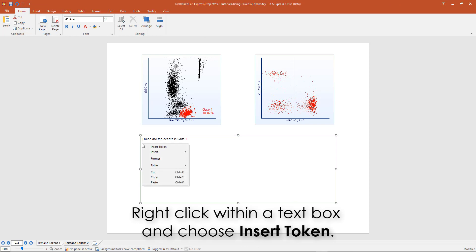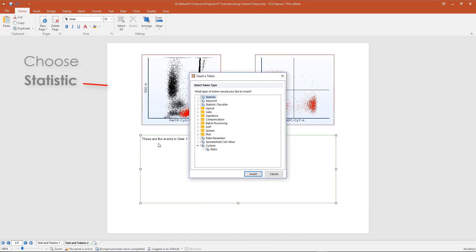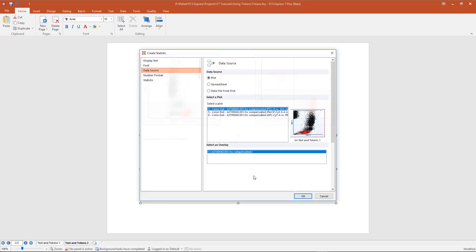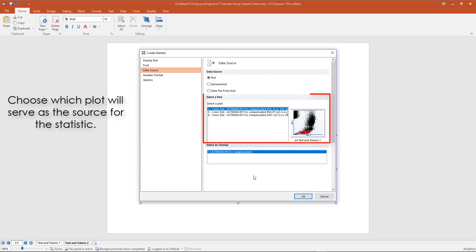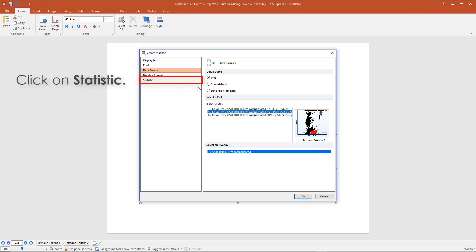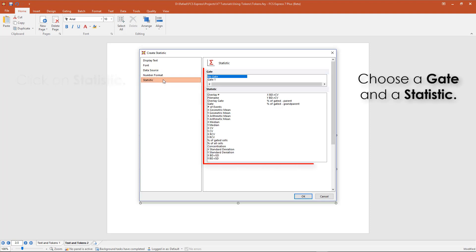Right-click within a text box and select Insert Token. Choose Statistic, then click on Insert. Choose which plot will serve as a source for the statistic. Click on the Statistic category. From the Gate category, select a gate, then choose a statistic.